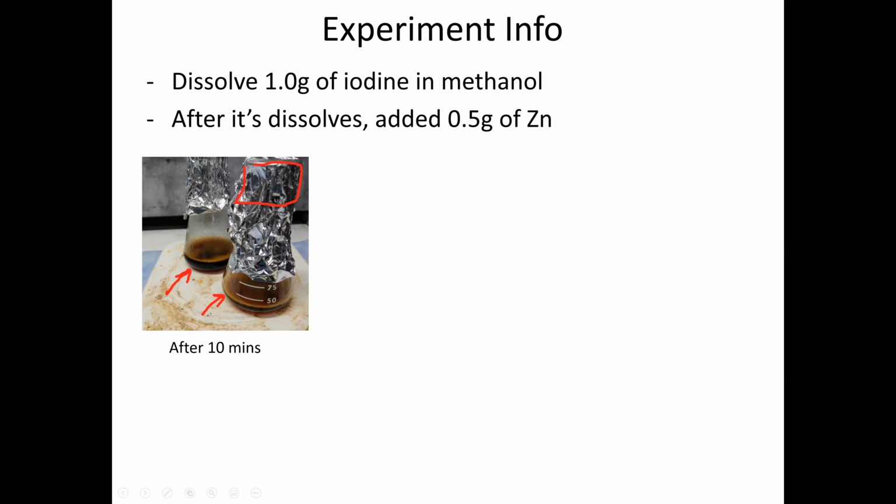color. And you want to have it heated just the right heat to where you form a small amount of bubbles. Where the methanol heats up, it condenses, it comes back down. If you see very large bubbles, it's boiling very vigorously, you want to turn down the heat. You want a very gentle, slow heating, slow boiling of your solution.